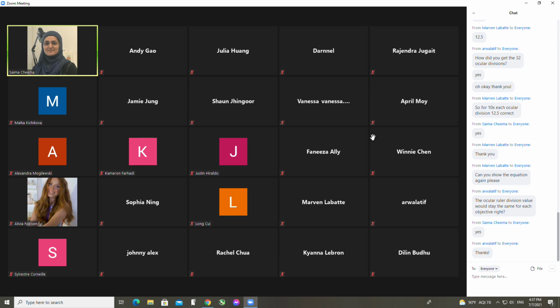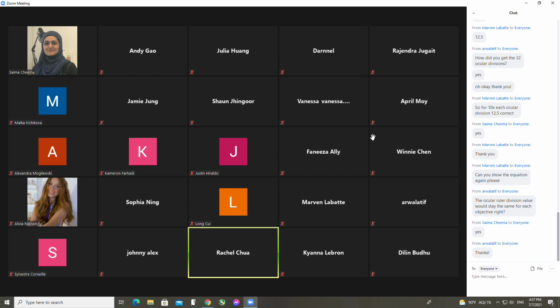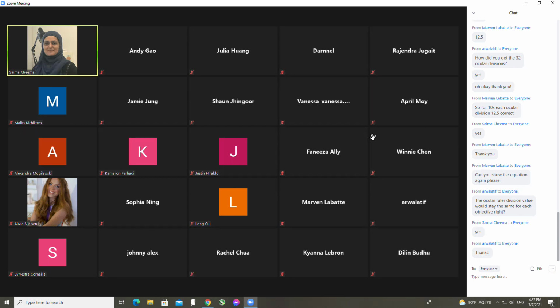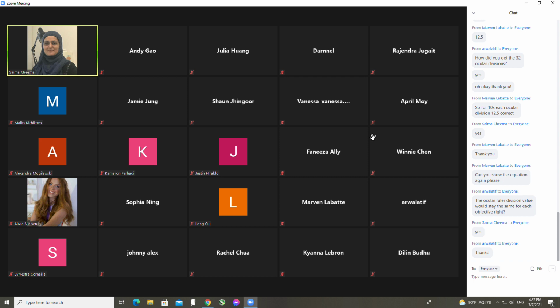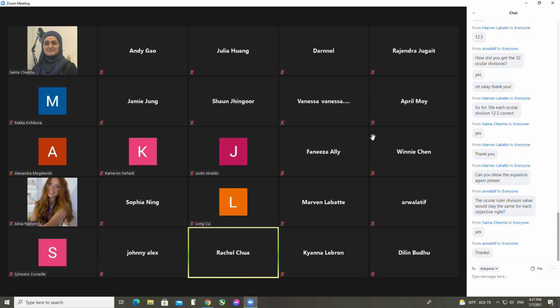Are they the same or different? It's the same, also 50 micrometers. So what do you expect under 100x? Also 50. It will be exactly that, but you can't measure it, so you're just going to say that it was too large to measure. Oh, okay. Thank you.